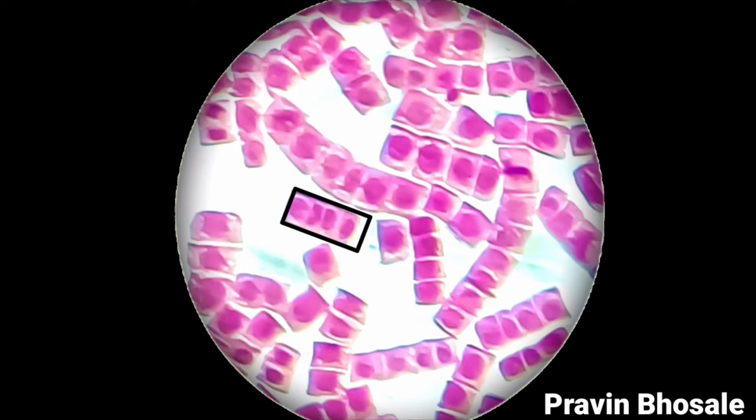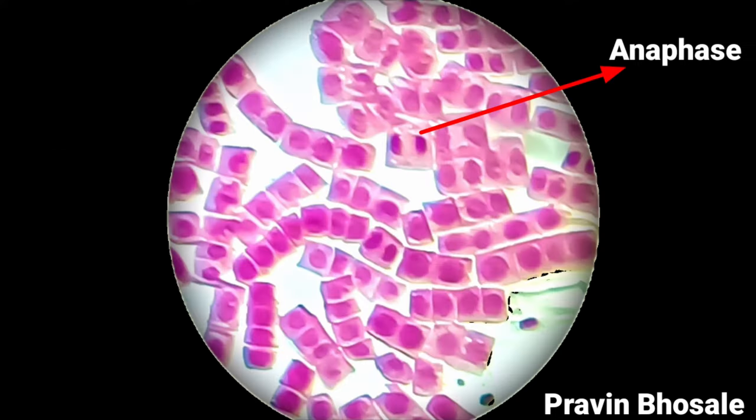Here in these two cells you can see anaphase. In anaphase, the sister chromatids are moving towards the opposite pole. Over here this is late anaphase — the sister chromatids have reached the opposite pole, and further there will be the telophase stage.